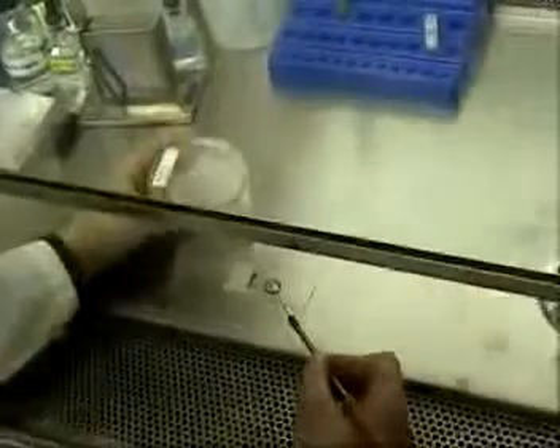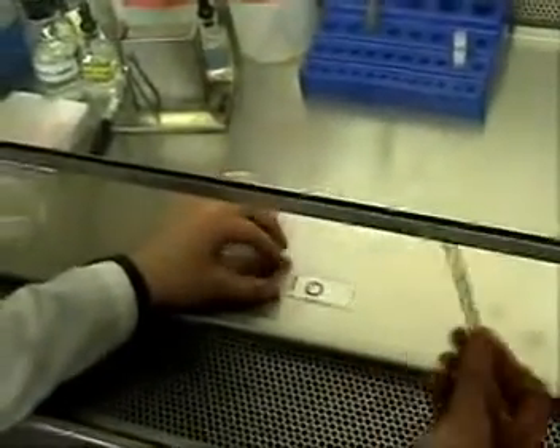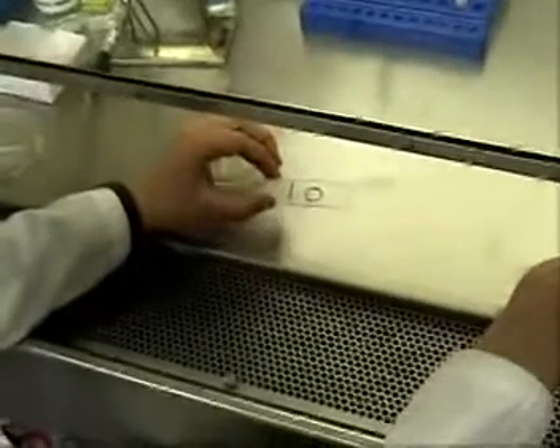Now take one isolated colony off of the plate using either your loop or your needle. You only need a very little bit. The biggest mistake you can make at this point is to use too much of your bacterium and to make a cloudy smear.